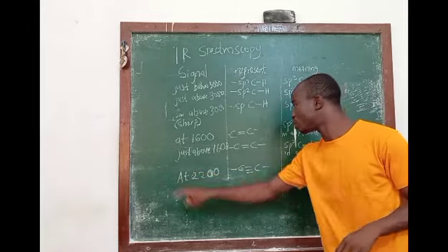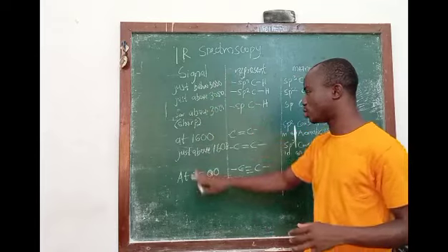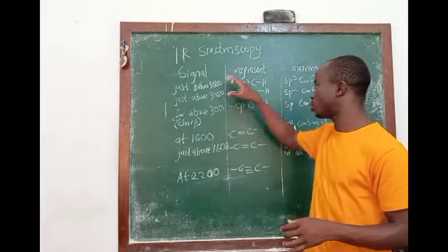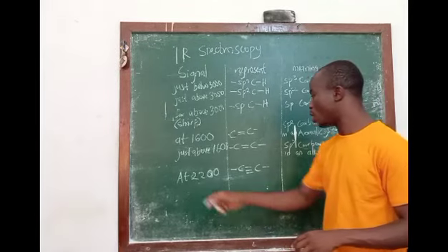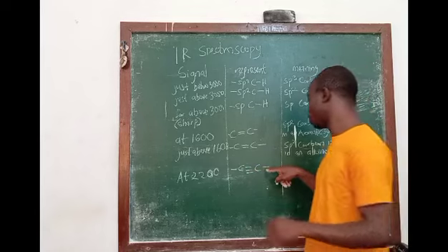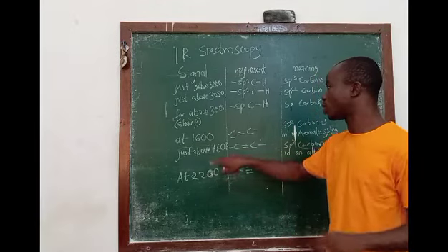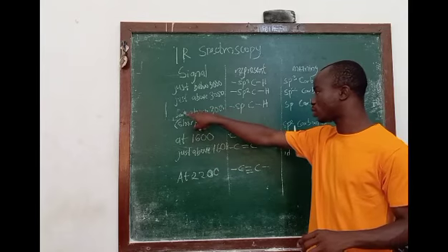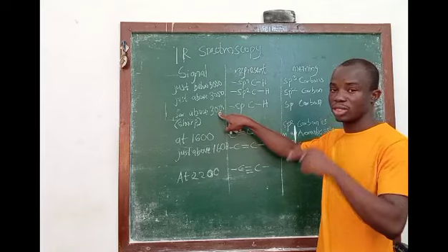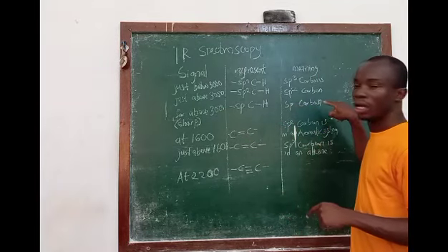Because the way they will ask the question is for you to highlight the signals that you can have in your spectrum, at the same time tell us what each of them represents. So the signal at 2200 represents your C≡C stretching vibration. And you can always use this signal to establish that the sharp signal far above 3000 that you see in the spectrum represents your sp carbon.